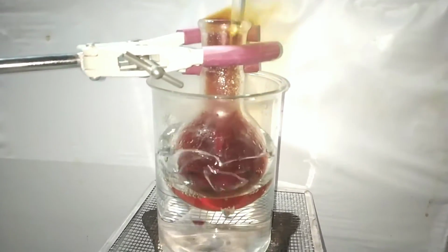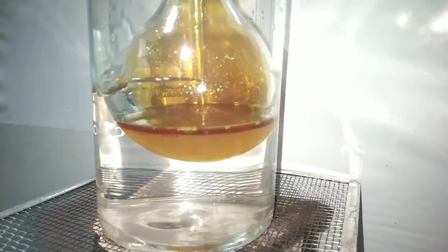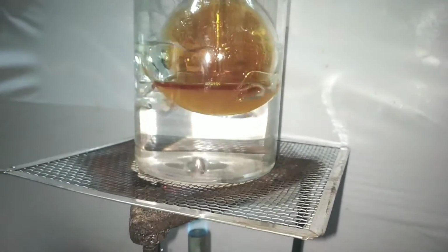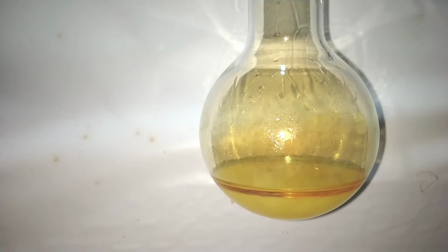After about 30 minutes, most of the nitrogen dioxide vapors are gone and no more nitrogen dioxide is generated, and this indicates the end of the reaction. The Benzil formed can be seen as an oily layer on top of the flask, which is a liquid as the melting point of Benzil is around 94 degrees Celsius.